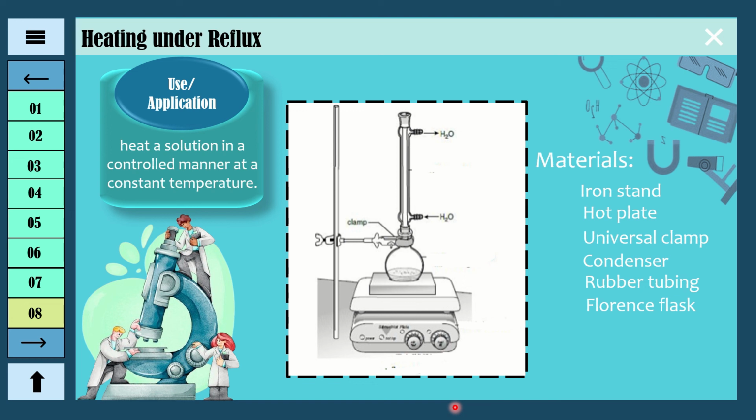While doing this technique, you will notice a reflux ring. The formation of a reflux ring is a good way to monitor the rate of heating. An indication that you are about to form a reflux ring is the formation of liquid droplets above the boiling liquid that look like sweat. You can find it here. There would be a reflux ring that will form here or also here that looks like liquid droplets. As the droplets become more numerous, a well-defined borderline forms where the vapor condenses, resulting in a reflux ring.